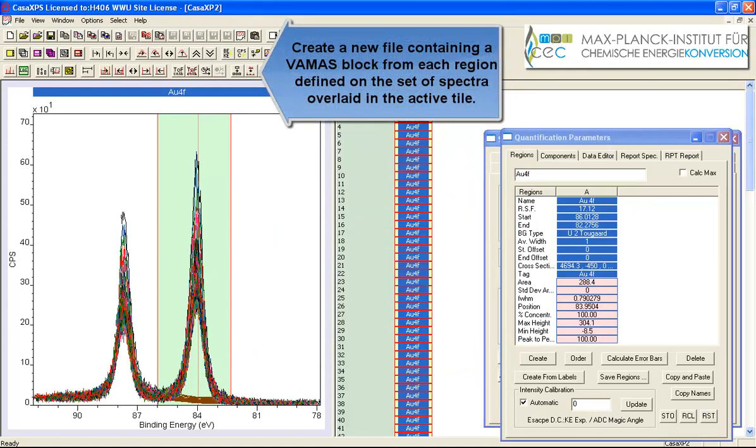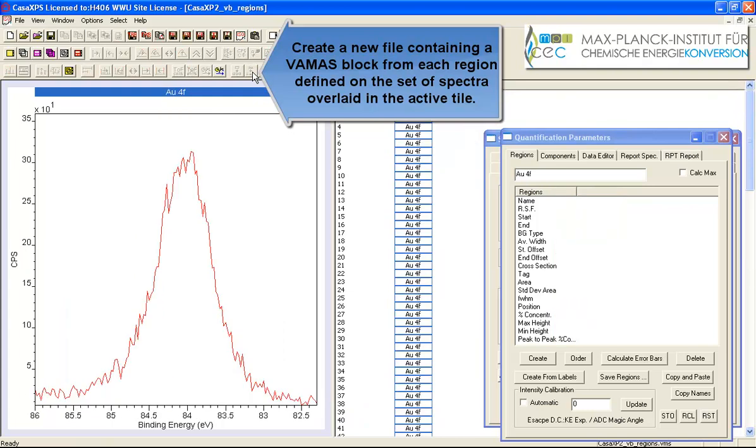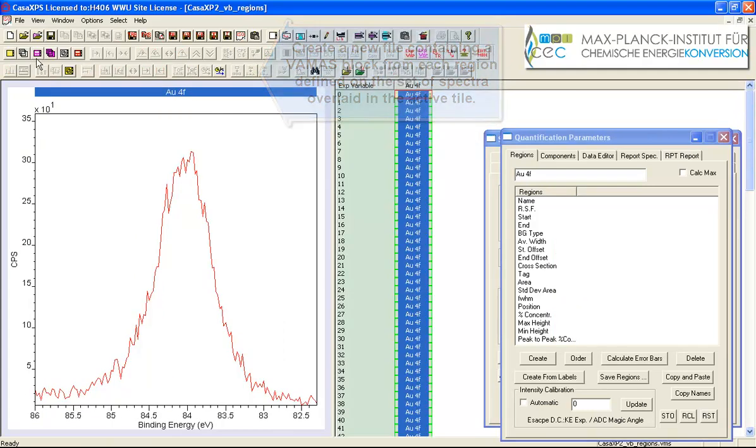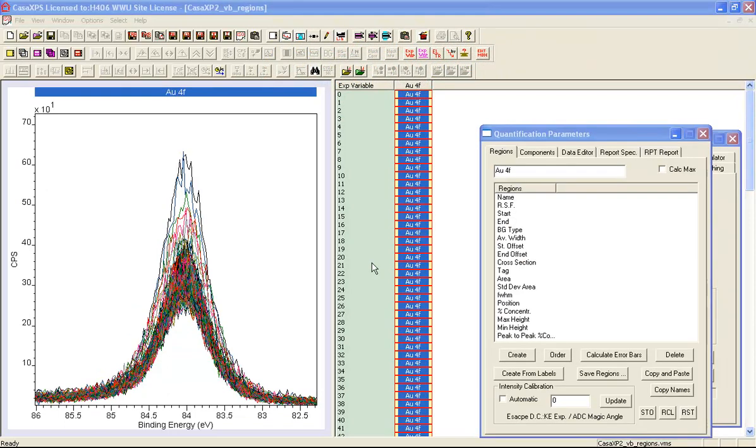And then I'm going to create a new file and that contains only these data from the gold 4f7 halves as to say that the data here has come from the region that was defined on the spectrum before pressing this toolbar button.